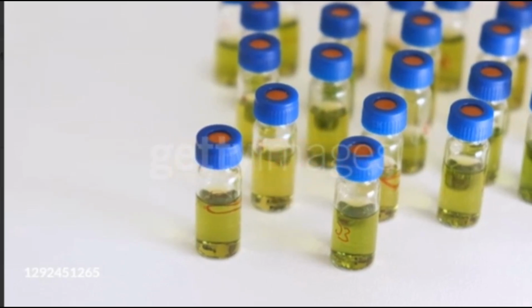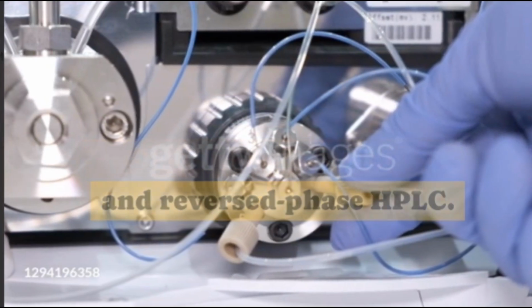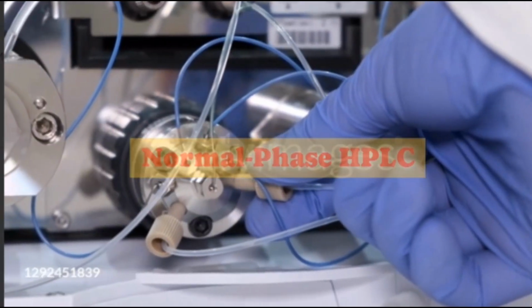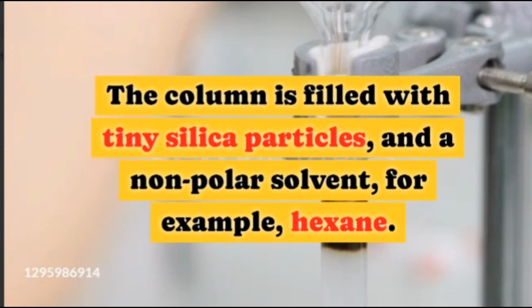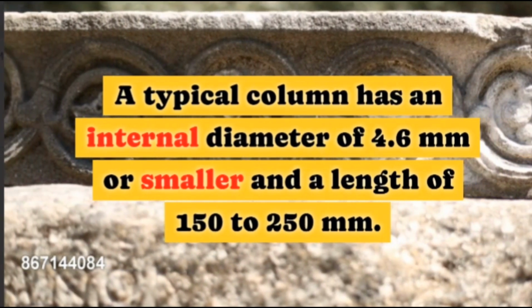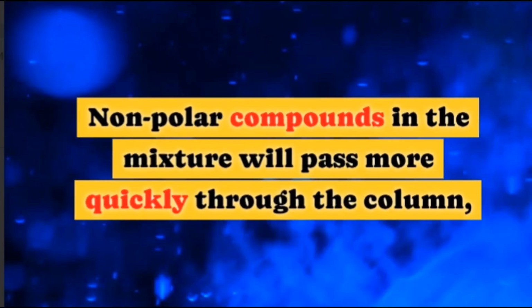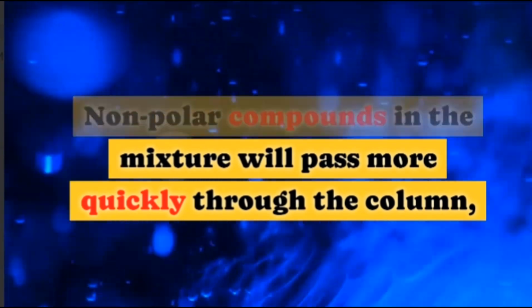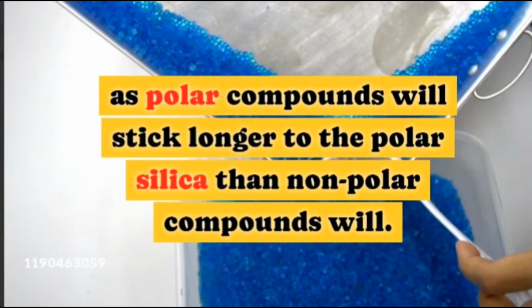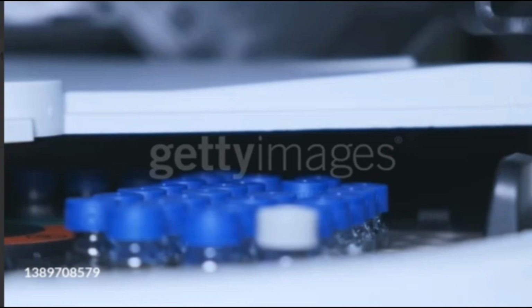Types of HPLC. The two most common variants are normal phase and reversed phase HPLC. Normal phase HPLC. The column is filled with tiny silica particles, and a non-polar solvent, for example, hexane. A typical column has an internal diameter of 4.6 mm or smaller and a length of 150 to 250 mm. Non-polar compounds in the mixture will pass more quickly through the column, as polar compounds will stick longer to the polar silica than non-polar compounds will.